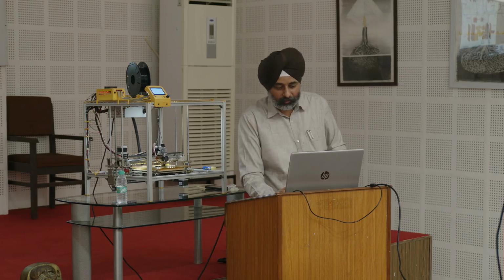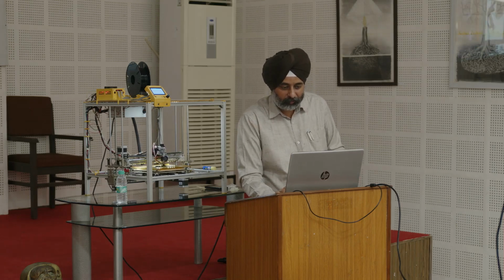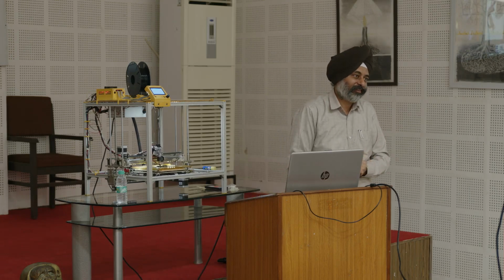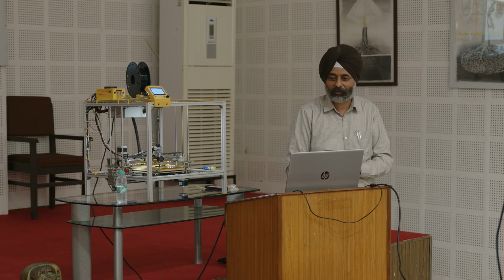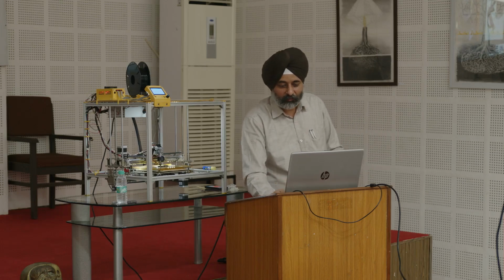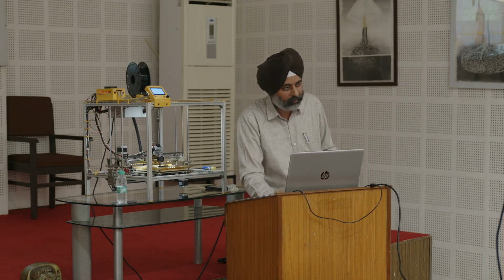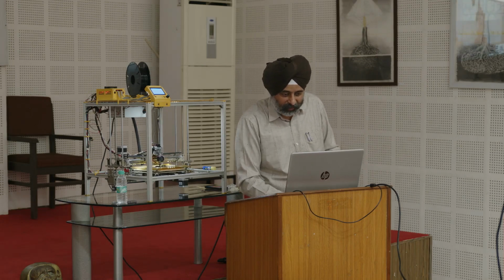Now for all these things to happen, you need precision control of movement, and for that we make use of stepper motors. This is a little bit of engineering that comes in, but I have tried to make it very, very easy for you to understand if you just know the basic physics of magnets and how they work.